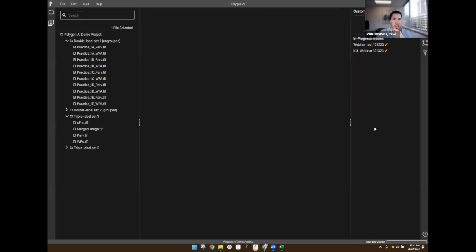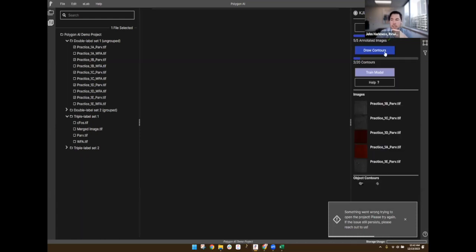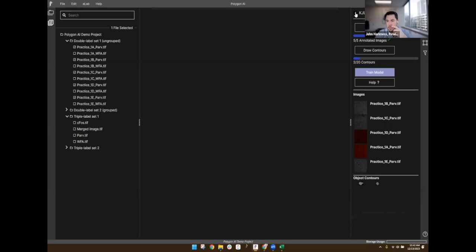Essentially, the two free models that you can train are just two separate projects, and so we can actually go back and continue to edit and retrain a model. So here Christy has two that we're seeing, and she could click on the edit button of either of those and add more images. So that won't impact the number of models that you have available. So that would just be one of the two.